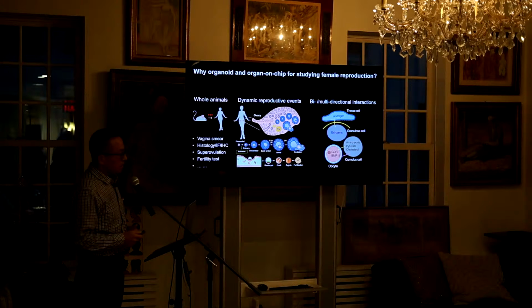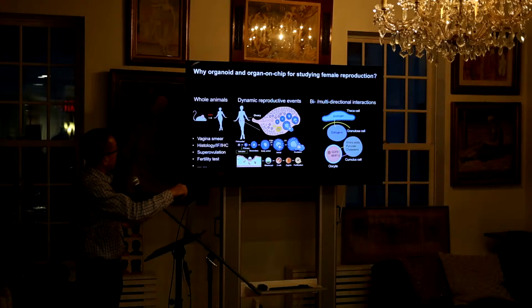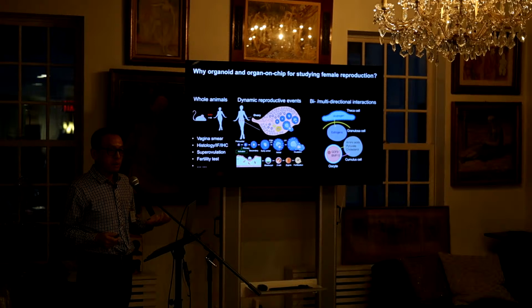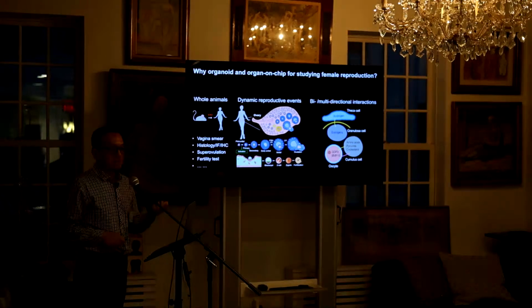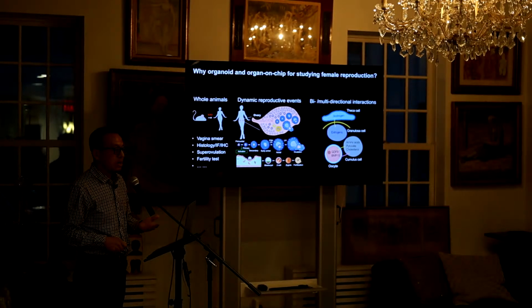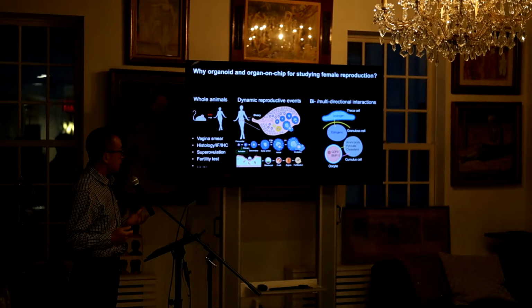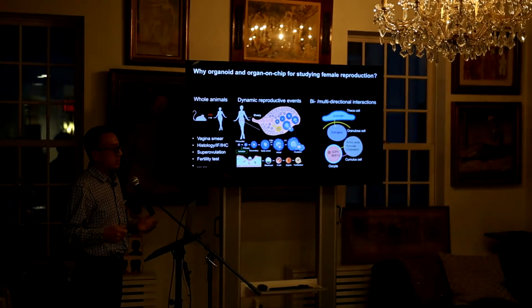So why do we need the organoid organ-on-chip research? For us, we always think about whether we have, for example, the stem cell induced organoid, whether it's ready for basic science or especially for toxicology research, whether it is representative enough for human ovarian function and especially for the oocyte development process. But I will say it's open for discussion.